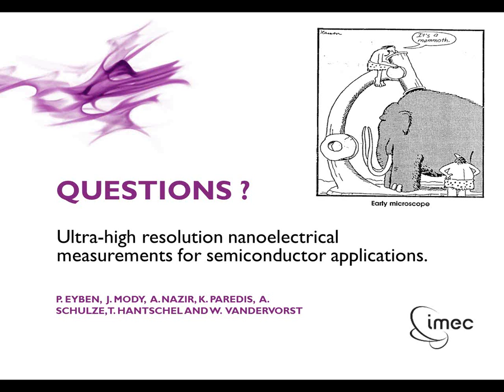If at any time there is a noise issue, consult with one of our regional applications experts, and they will help you out. Whenever you work in a controlled environment, there are quite a bit of cables that go in and out of that, so we need to make sure that those are properly decoupling noise, and those types of concerns.